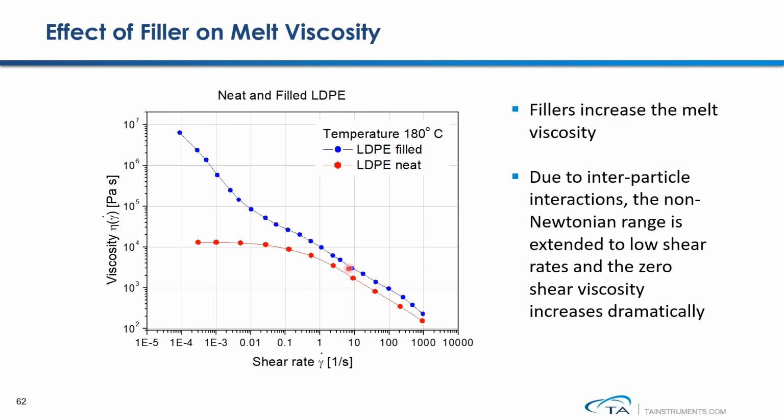The most obvious difference is observed in the low shear rate range. The filler particle-particle interaction causes this polymer melt to show more non-Newtonian behavior and more shear thinning. So the zero shear viscosity of this filled system is significantly increased.